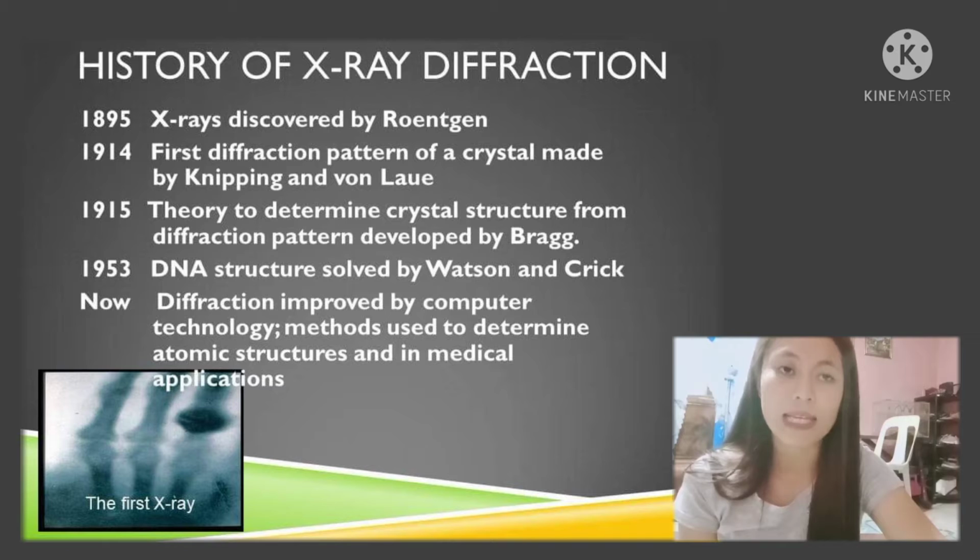After a few months, in 1915, English physicist Sir William Henry Bragg showed that diffraction patterns can be used to determine relative positions of atoms within a single crystal.